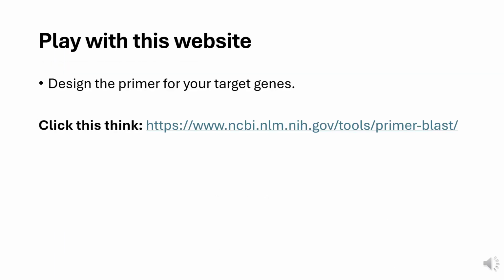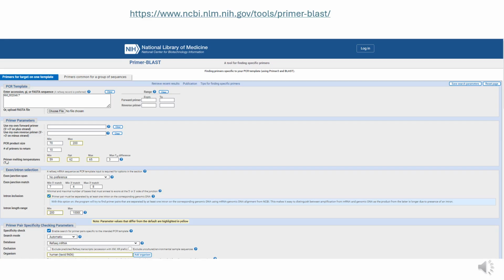So we will be using this NCBI tool, which is the Primer-BLAST tool, given by the NCBI website. We will be using this particular website for designing our primers. So this is how the NCBI website for Primer-BLAST looks like. This is the interface. I have prepared a separate video for you. You can watch that in detail.